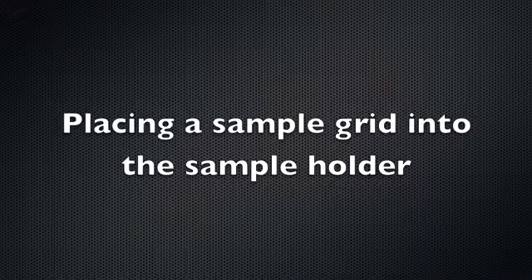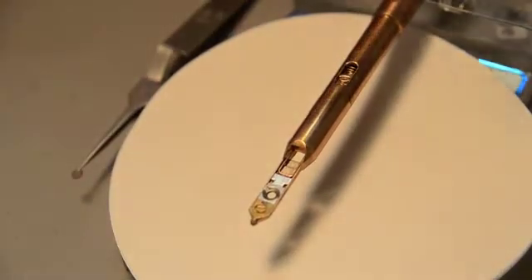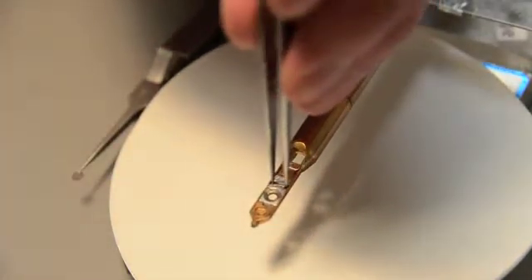Placing a sample grid into the sample holder: with a pair of strong forceps — not the grid forceps — pull the retaining spring back until the wire loop slips into its locked position.